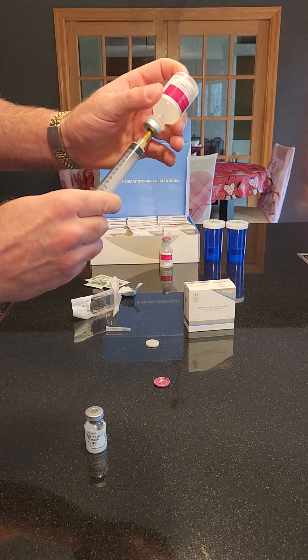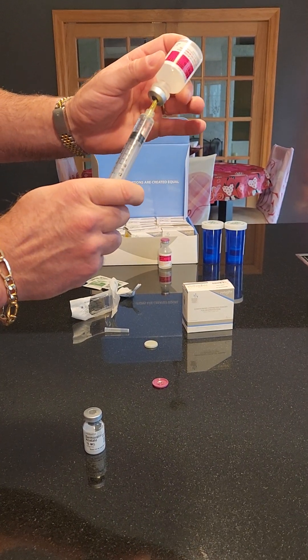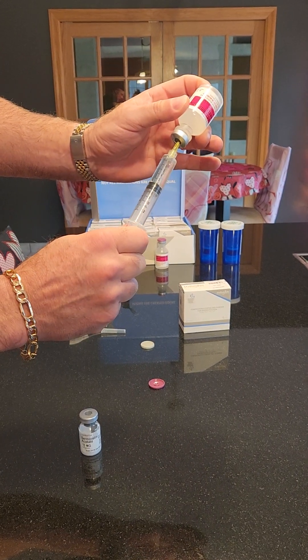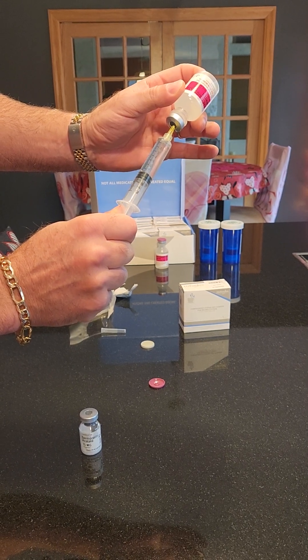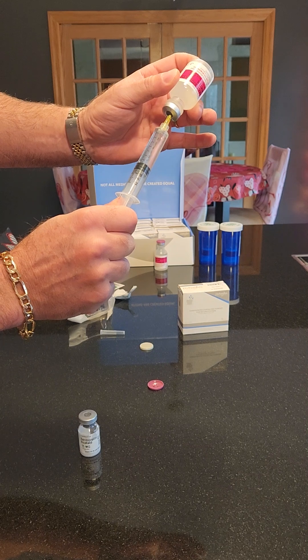I'm going to draw out seven point five milliliters, so I'll estimate it on this — it says seven and eight, so I'll estimate it. That's about seven point six, okay.